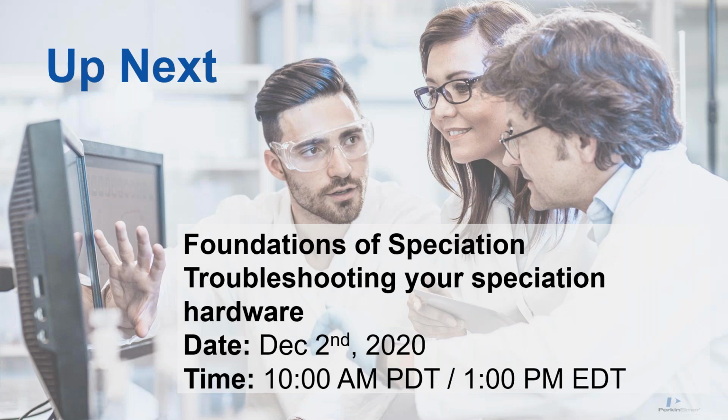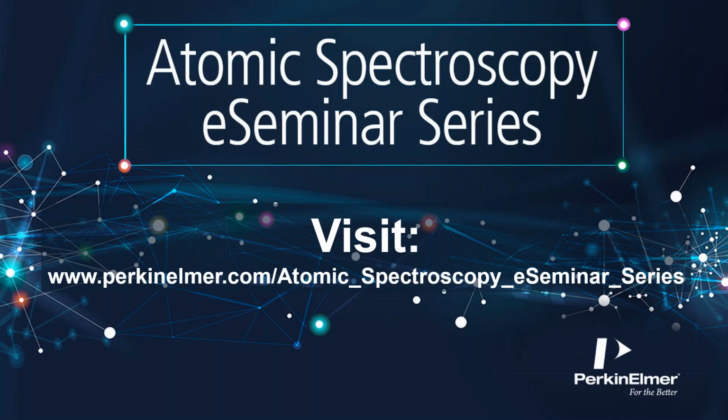One last question here, and then I have to go. Is the front end plasma source similar with the PerkinElmer ICP-MS? Brady, do you want to? So similar, yes. The same, no. The ICP-MS has a different generator, so it's a little different. ICP-MS and ICP-OES RF generators are argon-based RF plasmas. However, how they're electrically coupled is different. So yes, it's definitely slightly different.